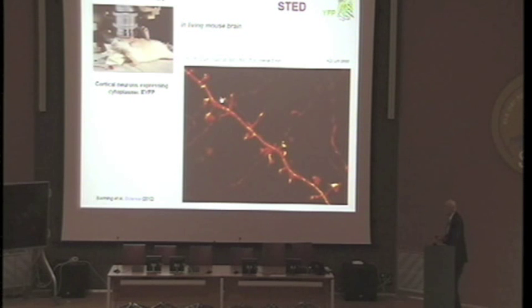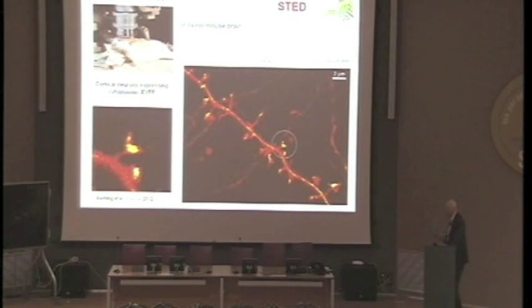And it's a time sequential recording, as I said, with 5 minute time intervals. And you see there are slight morphological changes going on here. Apparently the brain has to change, they have to change their position slightly. So you don't know what the mouse was thinking or dreaming or whatever. But there are morphological changes going on. And you need the high spatial resolution to see these little changes.